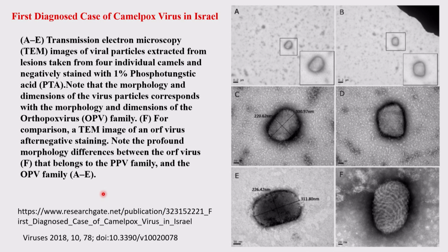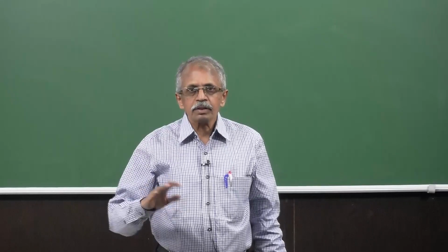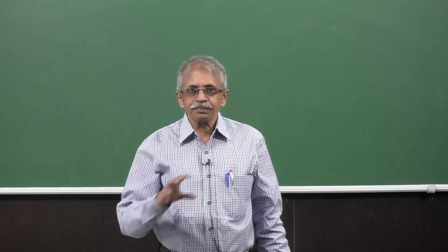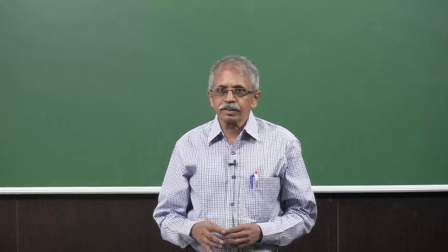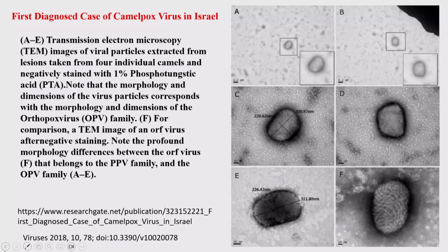Okay, so we have looked at a large number of examples of a variety of things, nanoparticles and nanocomposites. They identify different chemical regions, different coordination kinds, all those things you can map. And then these techniques can be extended to protein structure determination, viral particle detection, etc. So we have treated applications in quite good depth. The course is mainly for applications, so therefore we go into all of those.